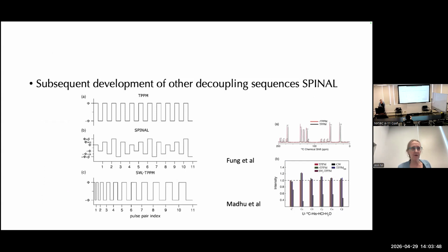So some other pulse sequences that are in the family came out later on from different labs around the world, and they perform maybe a little better here or there, but they're sort of in the same range. It's not just that you're going to resolve your peaks better, but as you are resolving them, you are also improving your signal to noise, and we're desperate for that. So this was a big deal to have this family.